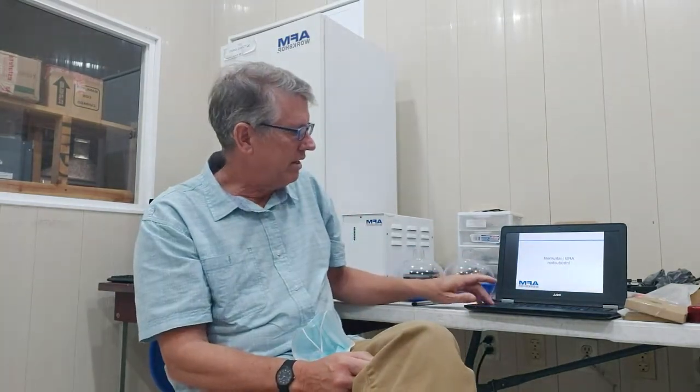Okay, so this is a small presentation here on the microscope instrument, and it kind of shows you how it works. This is what we normally do as a three-day training. We'll just do everything today, because you already know how to run it, and you're learning because you have access to it.